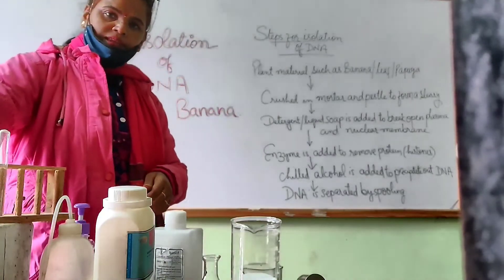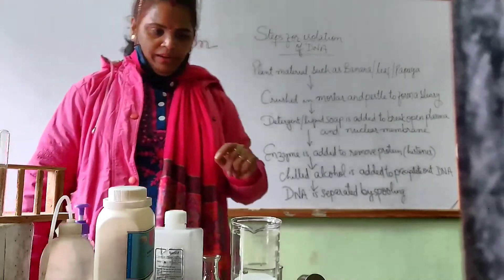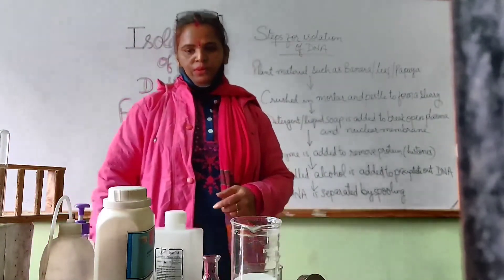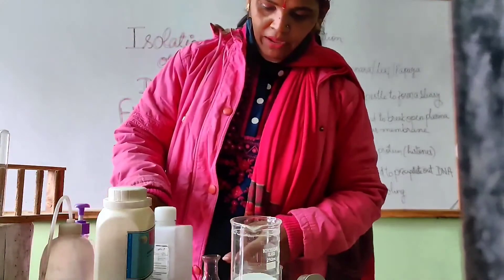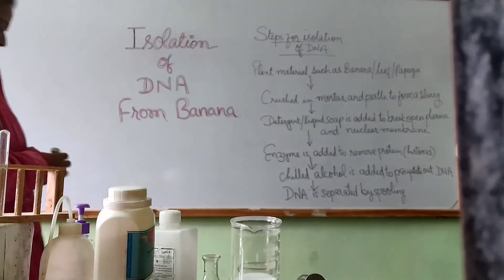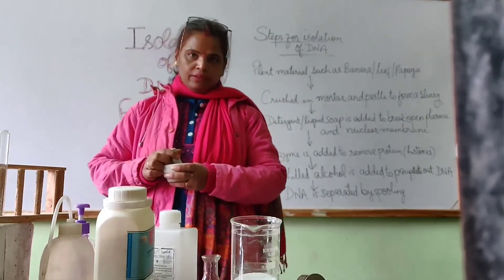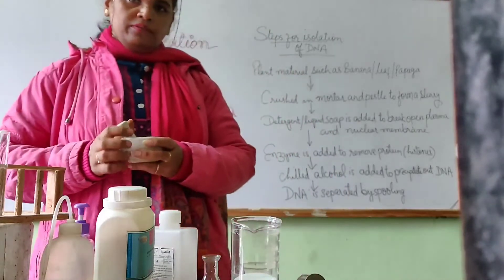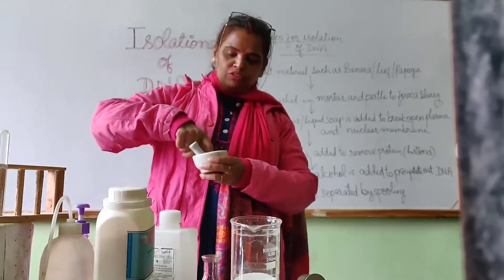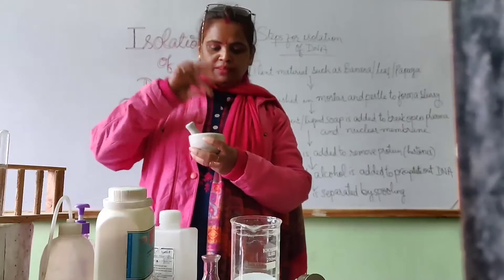These are the steps to isolate DNA material. So children, let's perform this activity of your biology. Now children, we are starting DNA isolation. First of all, we have taken this mortar and pestle, and a piece of banana, and place it in this.